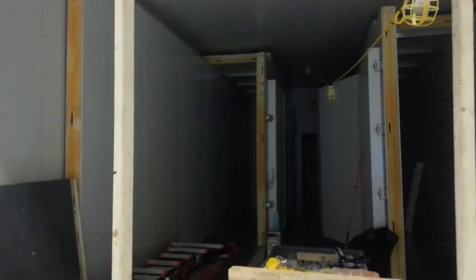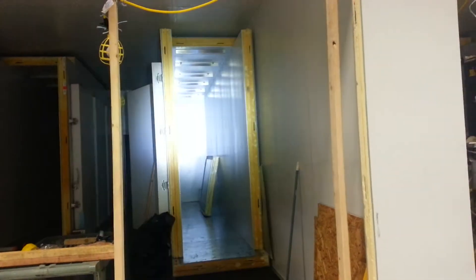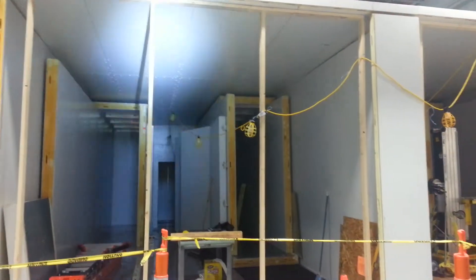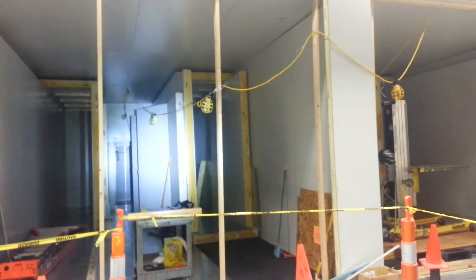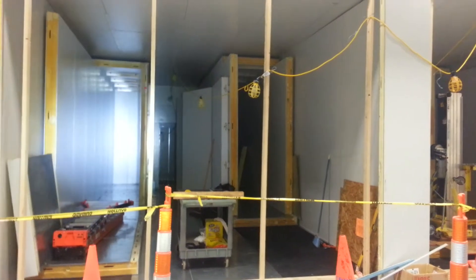All right guys, as I was telling you, that is the inner chamber of the minus 70. You can see it's one big walk-in cooler, walk-in freezer, inside of a freezer. So this is your minus 70 side.